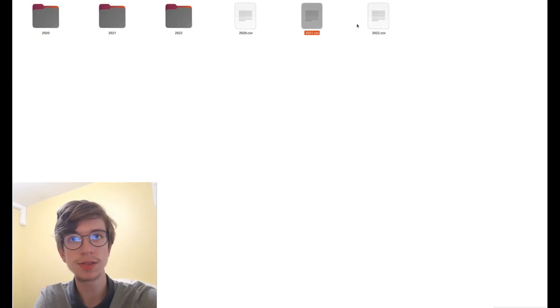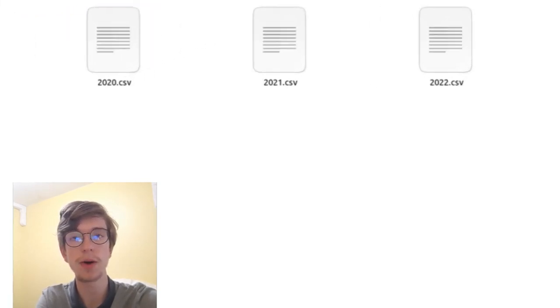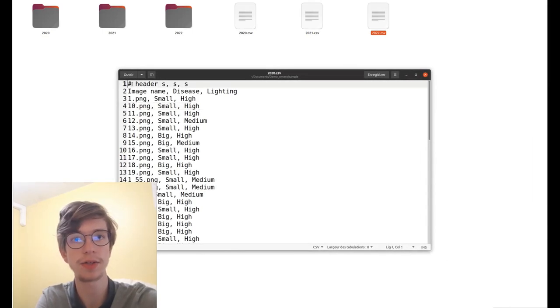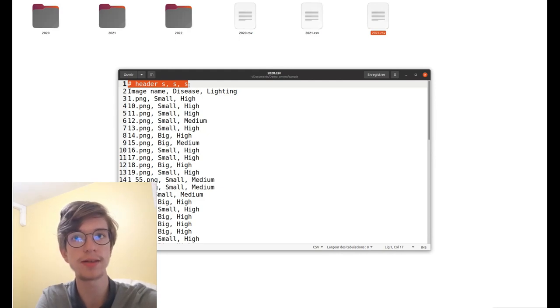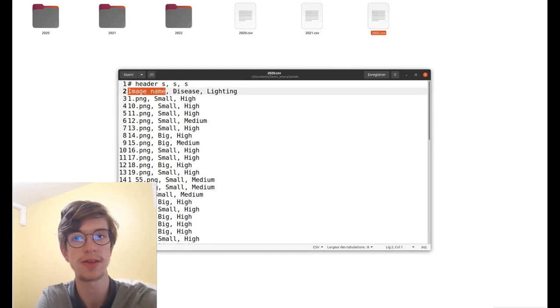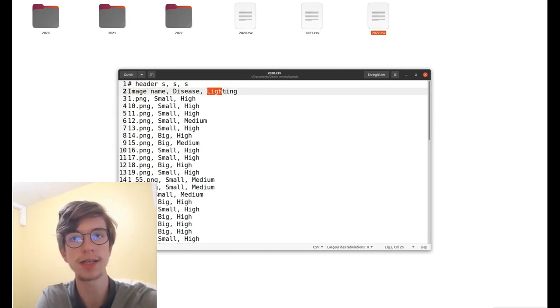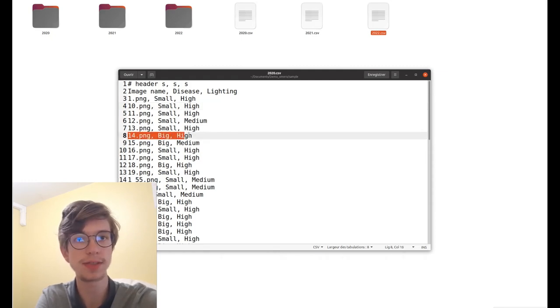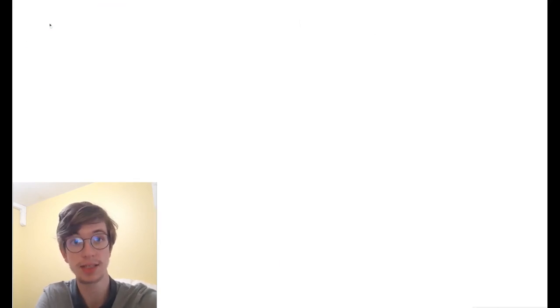There are also some CSV files, one for each year. In 2020.csv you can see a first line which is a header, and then the second line has the name of each column: the image name, the disease, and the lighting. For each picture you can see if you have small or big disease, and high, medium, or low lighting. So in this example, with 14.png, we've got big disease and high lighting, and we can check that.